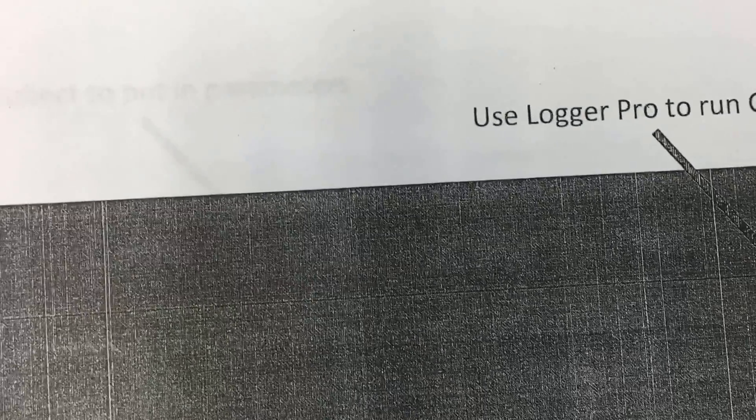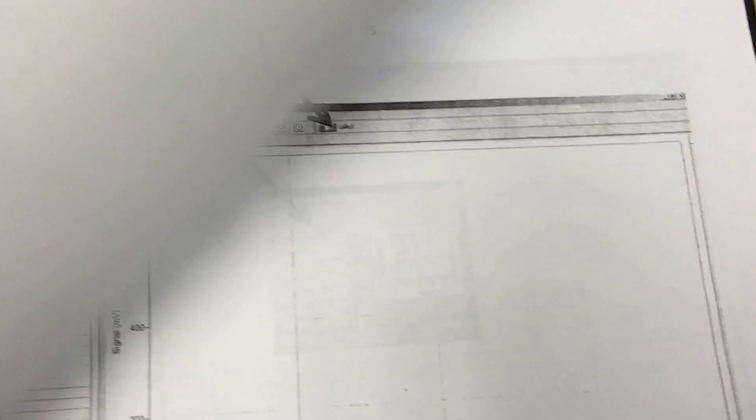The program that has been installed is called Logger Pro to run the GC, and this is the printout. The basic setup is very simple.